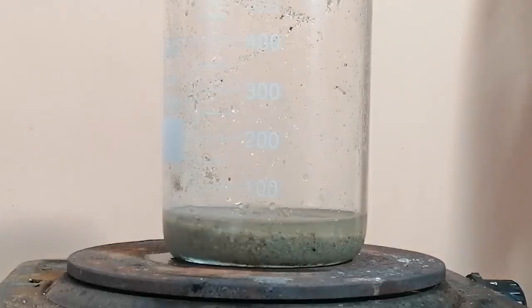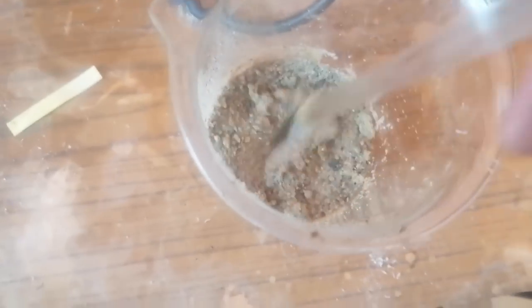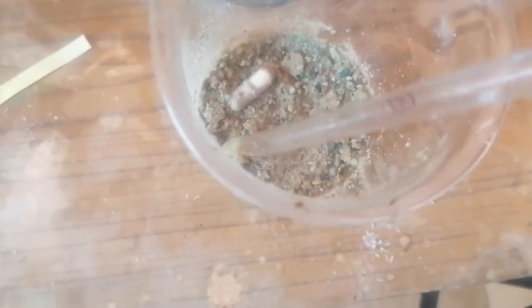Then I've decanted all the water, washed it, and finally put it on a hot plate. Now we're left with much purer silica than before; however, this is still not enough.